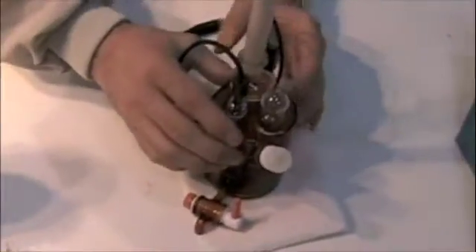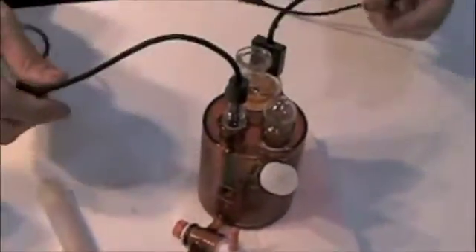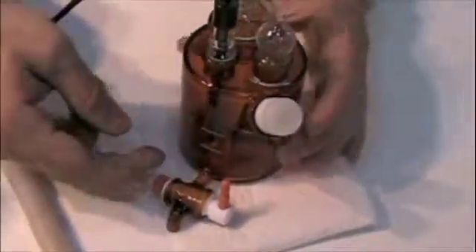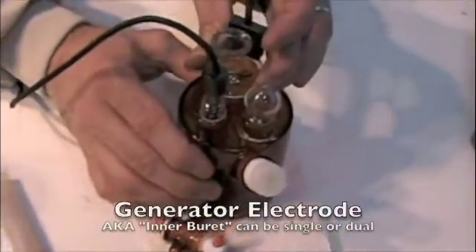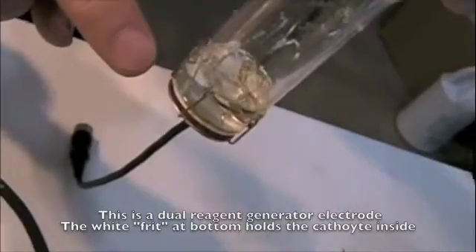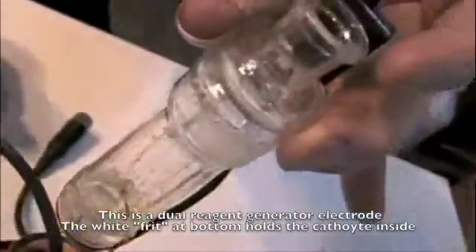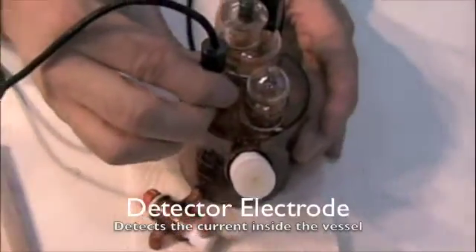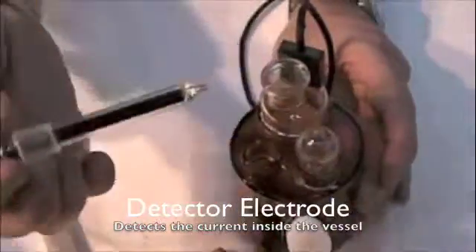The first step involves the generator electrode. You've got a desiccant tube and a number of ports on the top and on the side. This one has a drain valve. This particular port houses the generator electrode, which has metal on the bottom and some fluid inside, and it sticks down inside the vessel. The other electrode that goes into this is the detector electrode.